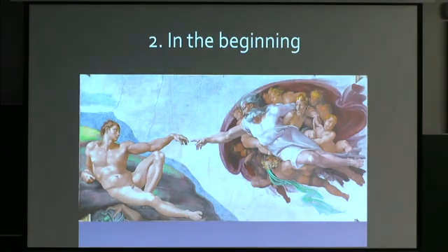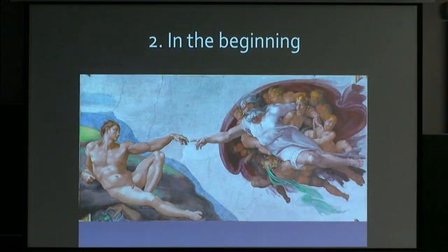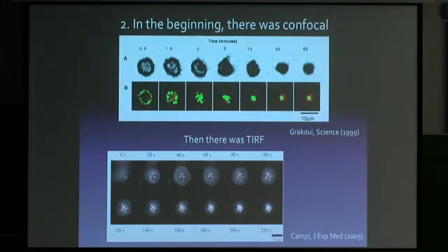All right, so in the beginning, there was confocal. Confocal microscopy is still an extremely useful tool, but it gives you a relatively blurry view of, say, different surface receptors moving around on the surfaces of cells. Here the scale is 10 micrometers. This is one cell interacting with some antigens on a glass. You can see this kind of blurry picture. You get the sense there might be some clustering, there might be some inhomogeneity there, but they just sort of move around according to this.